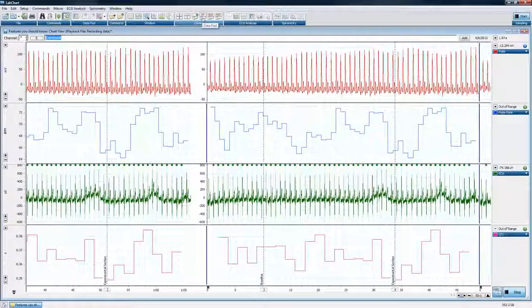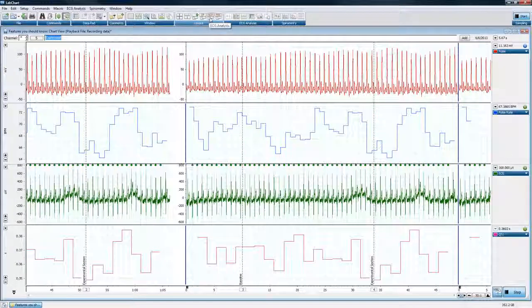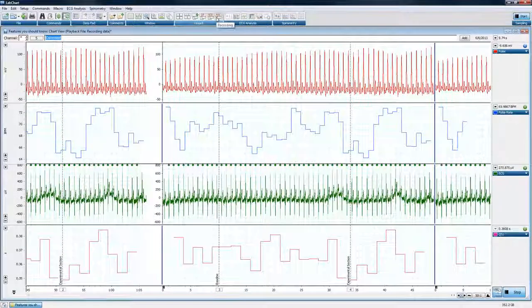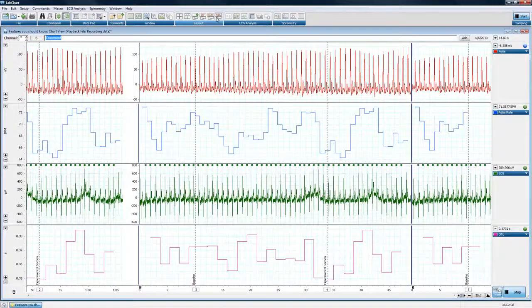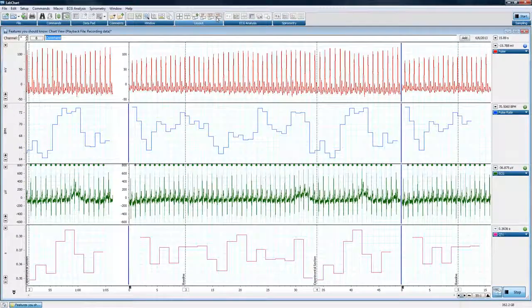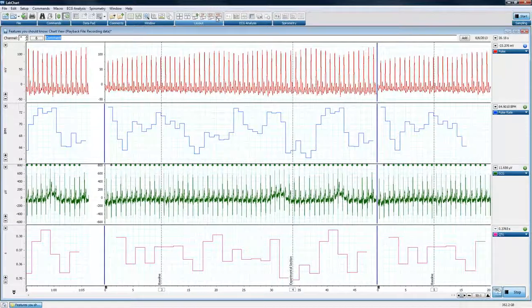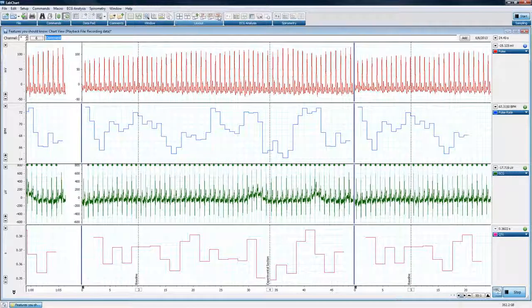Okay, I've saved a data pad layout. If I hover my cursor over this, you can see data pad here. I have a layout for ECG analysis, and I have a layout for recording. So the circumstance that I'm trying to create is one where a user would want to see different things under certain circumstances. So I saved 3 layouts here.